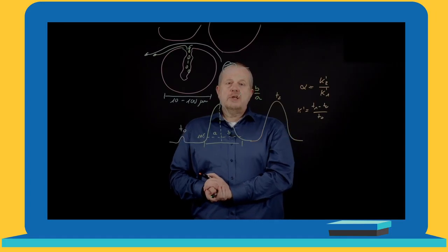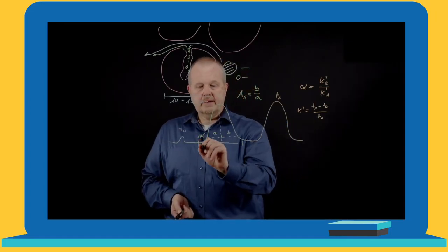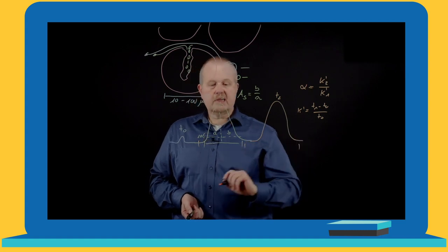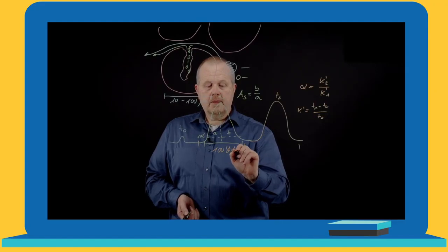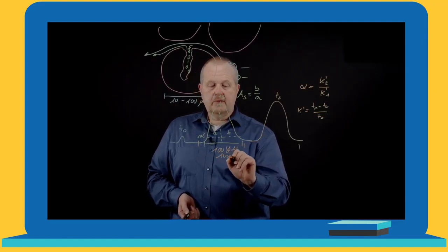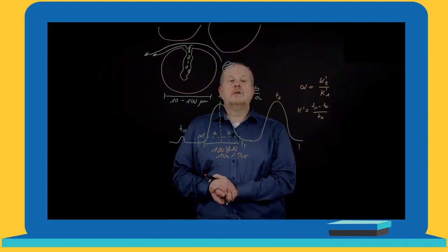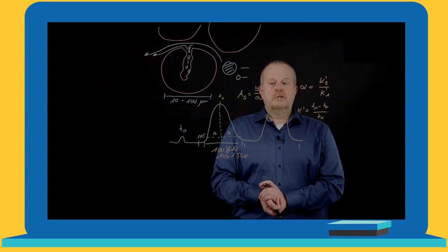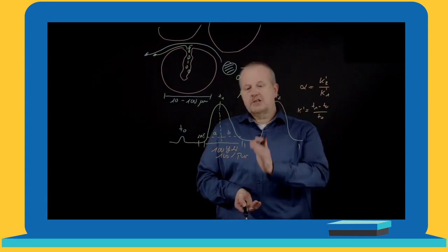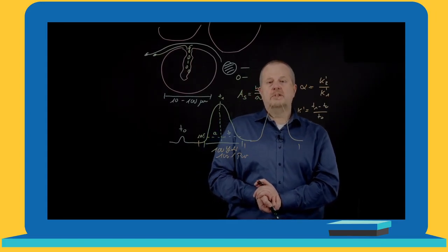When we have this situation, we can separate peak A, the first peak, and the second peak with both 100% yield and 100% purity, which is ideal. In preparative chromatography, that is our ultimate goal. We would like to have as much material as possible with a maximum purity.